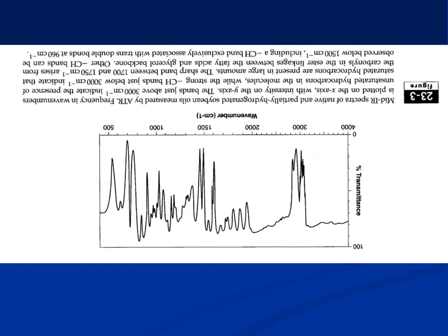And then you can go to another technique, like NMR, UV, or mass spec, whatever, and compare, and then you can conclude from multiple techniques whether something is present or not. So a sharp band at 1700 or so, which is around here, shows you that there is a carbonyl group.